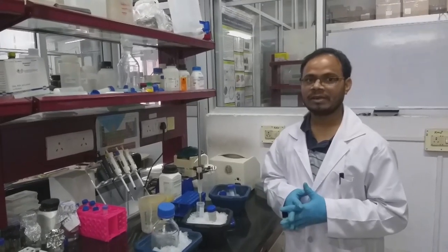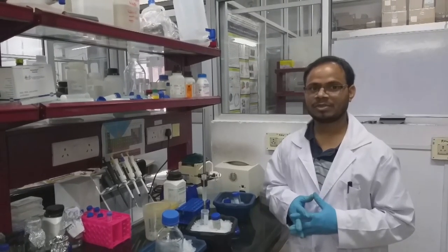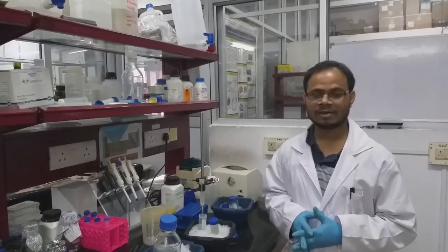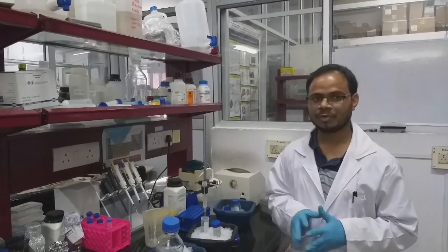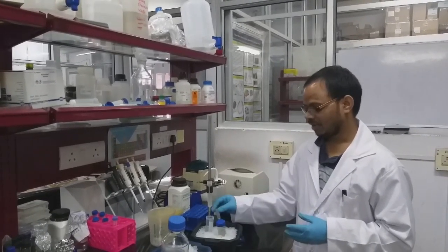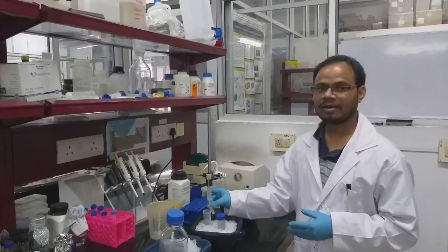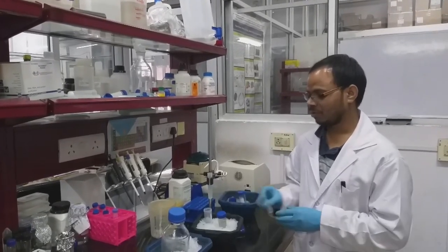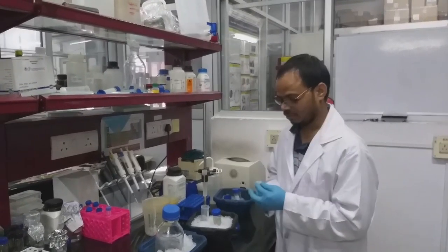Say you are getting only 10% of the protein in your purified fractions and 90% of the protein eluting in the flow through. In that case you can reuse the flow through for purifying the protein. So you have to collect the fractions in small microcentrifuge tubes, and we have to save those fractions, label them and save.